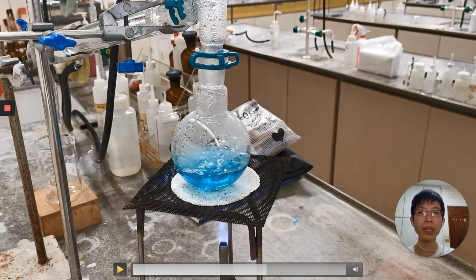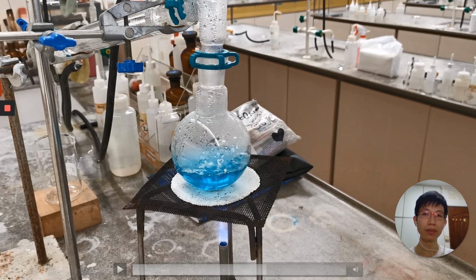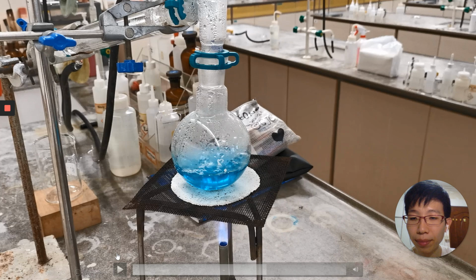And there should be a thermometer on the top, which I didn't manage to capture, but there's a thermometer on top to capture the temperatures of the vapor. And it will be at a temperature of 100 degrees Celsius, as this is the boiling point of water.